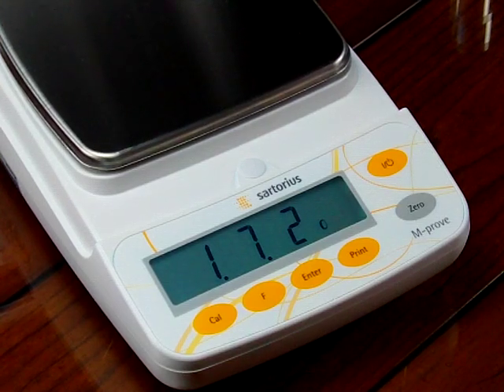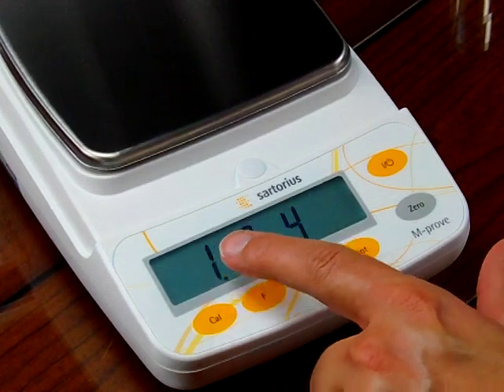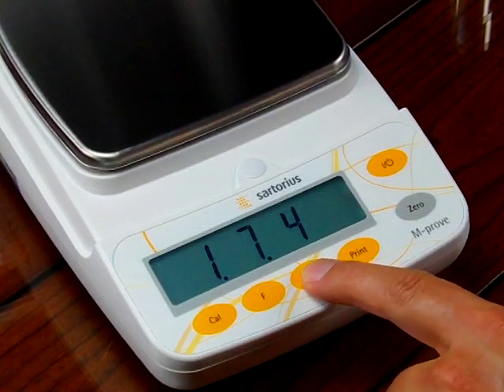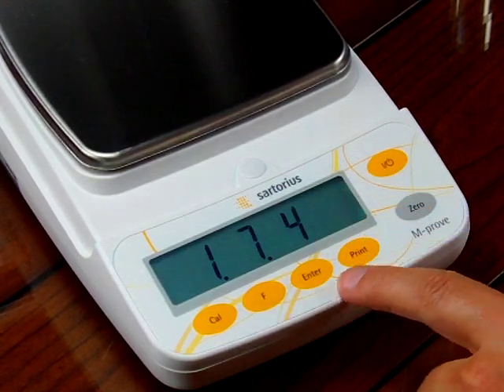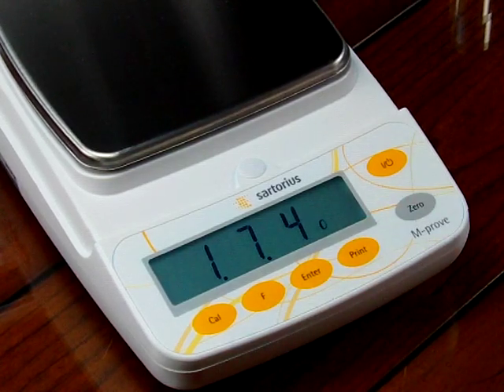We're going to change from 172 to 174 for carats, so we hit the F key until we reach 174. Now we need to store it by pressing and holding the enter key down. You'll notice a little circle that will illuminate, meaning it's been stored.